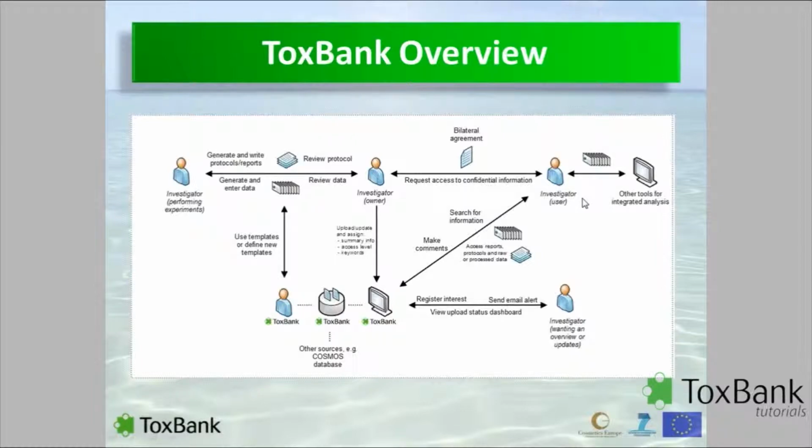The data has also been formatted in this standardized manner, and it also includes processed data. That information, both the raw and the processed data, can be accessed and used within other tools to support a meta-analysis, such as processed transcriptomics data being used in gene enrichment analysis to support identification of pathways, or used in modeling or data visualization tools.